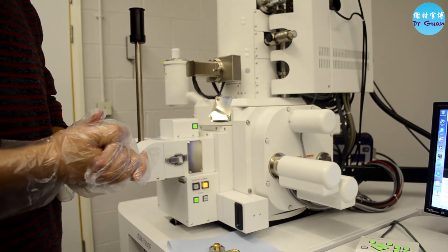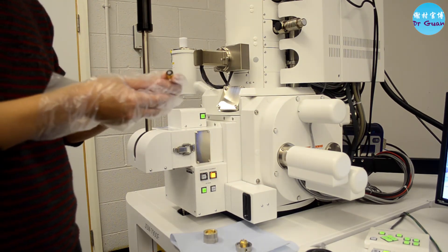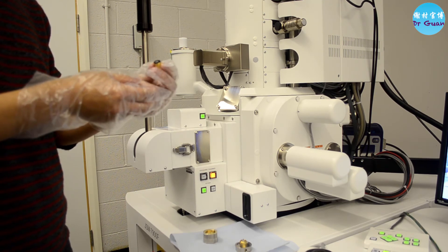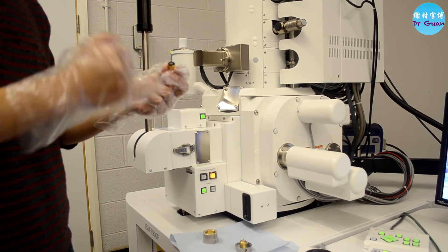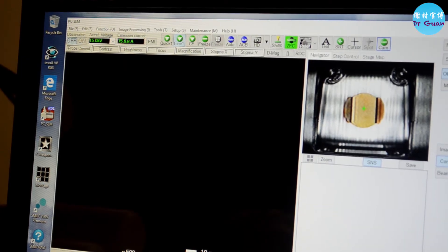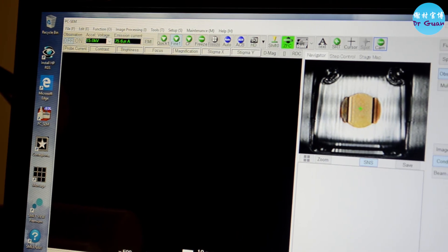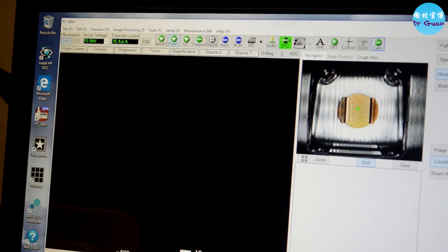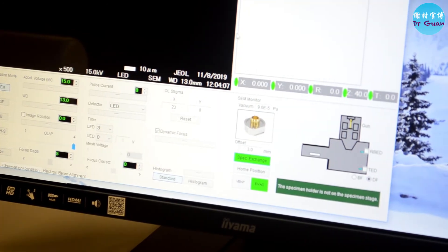Now we are going to load the sample. Today I'm going to use the standard sample from Oxford Instruments — it's FCC steel, electropolished and stuck to a carbon sticker. That's fine since we're just using it for training purposes. Make sure the beam valve is switched off — there should be no green button lit here. Also check that the stage position is in the specimen exchange position, which should be shown in green.